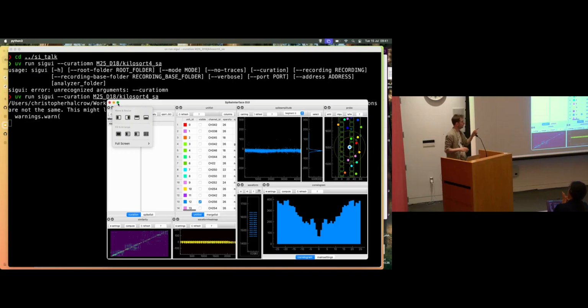Yeah. So this is just a one sorting at a time system. The tool that's been developed that I would use is LUSAC by Aurelien W. They use some graph theory methods and try and link units from different sorters that look similar.